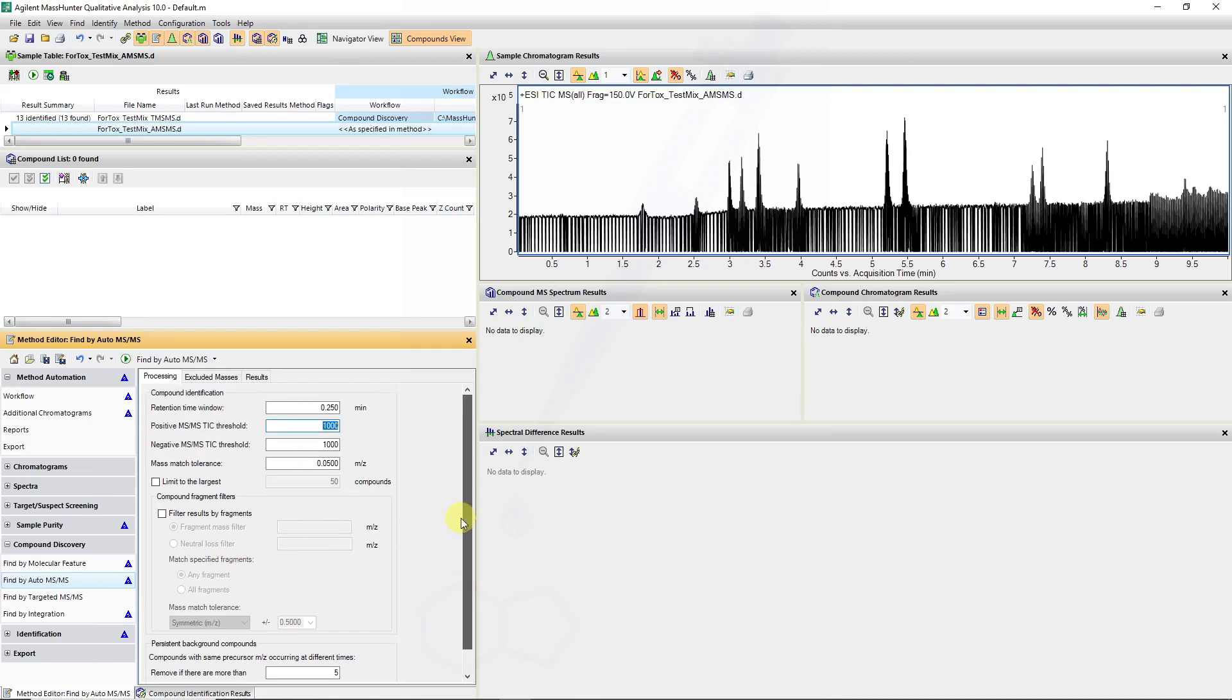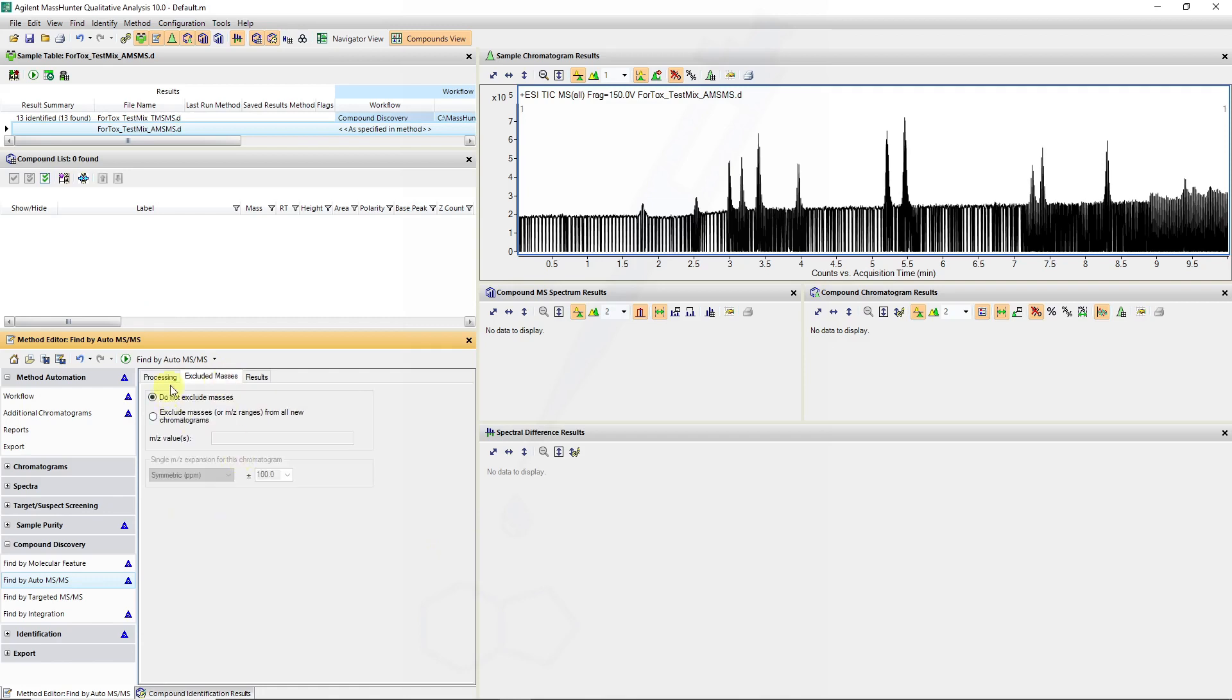For some of the other features we can exclude certain masses as well, like if MS-MS has been done on the 121 or 922 calibrants in positive mode or the negative mode equivalents, then we can also exclude these.